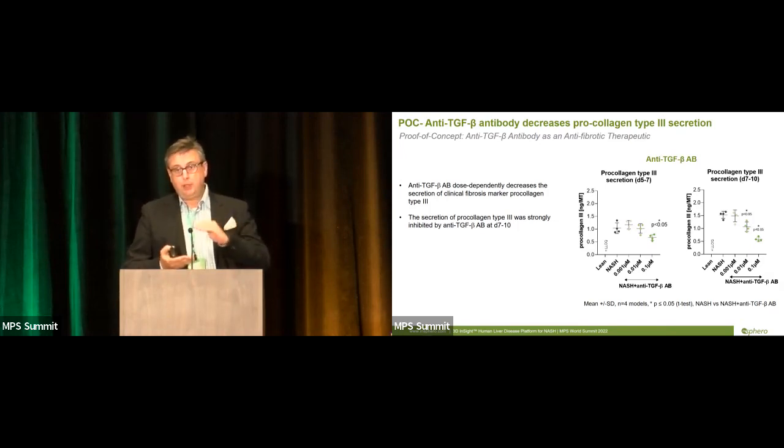We have pretty good consistency from model to model, so high statistical relevance in this assay. This is a measurement that's taken in supernatant, so we can also look at longitudinal changes over time inside the same tissue and multiplex this with inflammatory marker quantification using the Luminex assay.